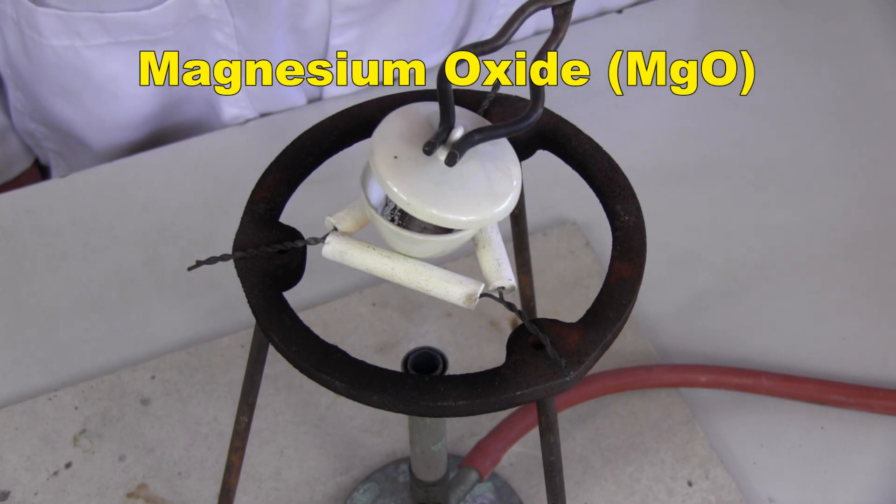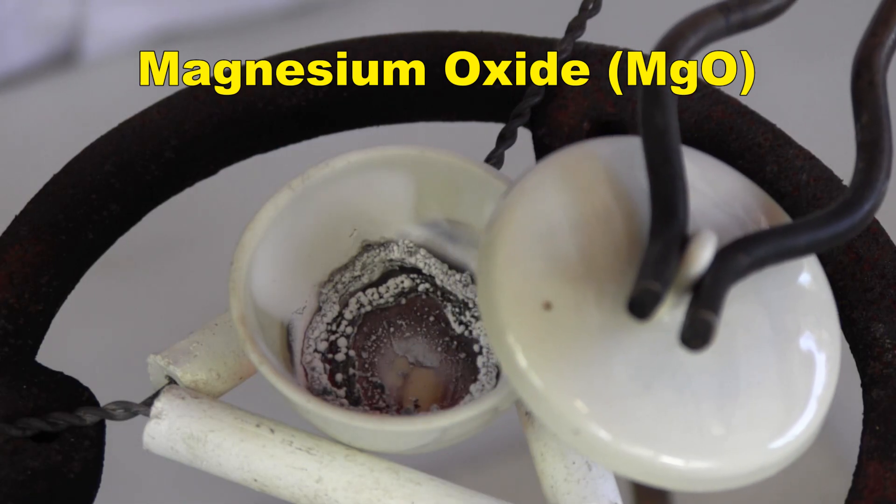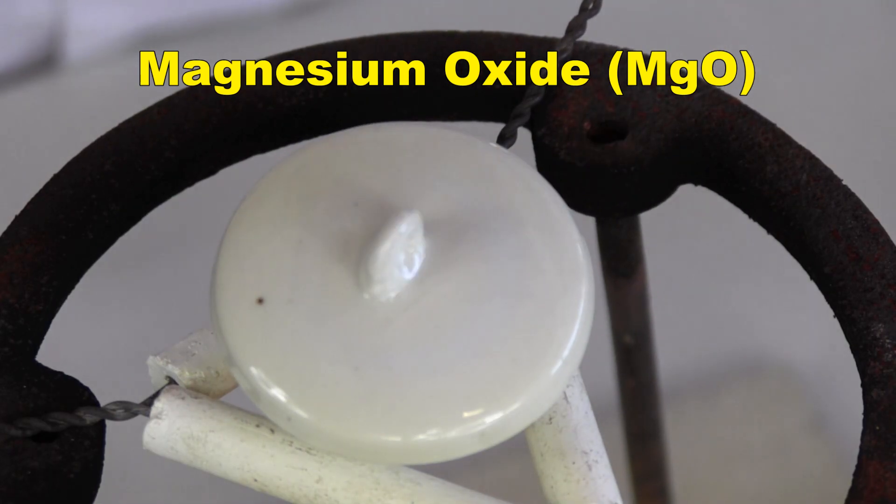In this video, I'm going to explain how to make magnesium oxide in a way that allows you to analyze the ratio that magnesium and oxygen combine in to produce it.